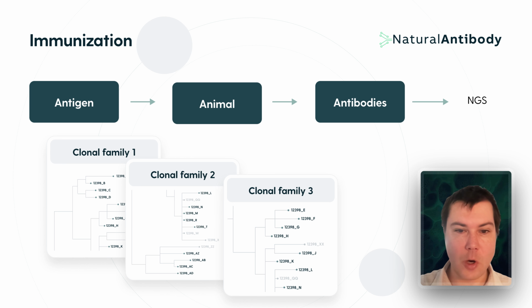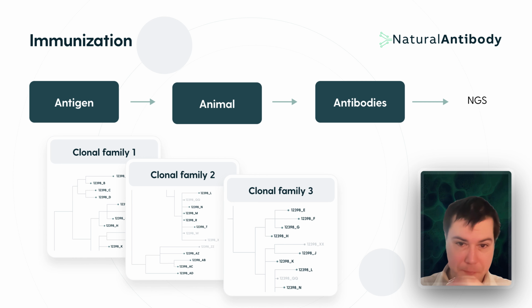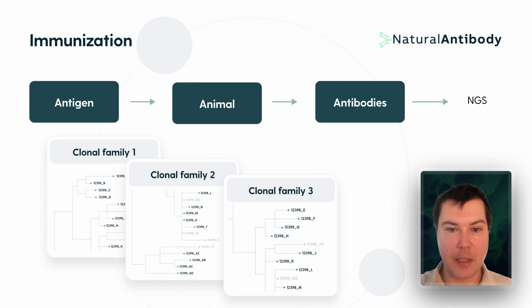So you are identifying the so-called clonal families. Each clonal family should be a set of sequences that diversified from the initial binder. On the left-hand side of each of the trees, you have, let's say, the parent cell, and then as the sequence matures, it is farther and farther away from this germline cell.